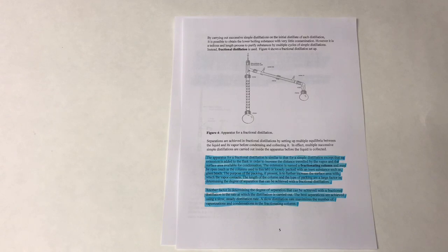The length of the column and the type of packing are a large factor in determining the degree of separation that can be achieved with a fractional distillation. Another factor in determining the degree of separation is the rate at which the distillation is carried out. The best separations are achieved using a slow, steady distillation rate. A slow distillation rate maximizes the number of vaporizations and condensations in the fractioning column.